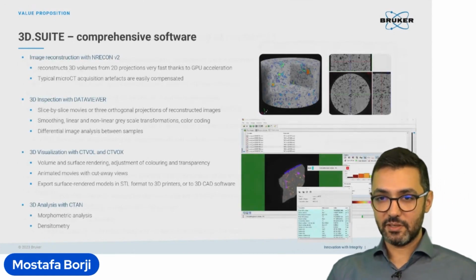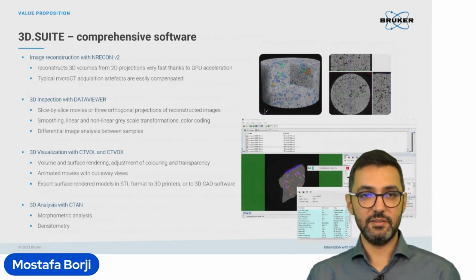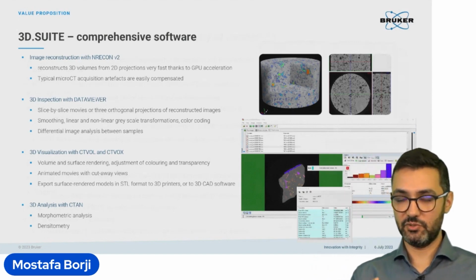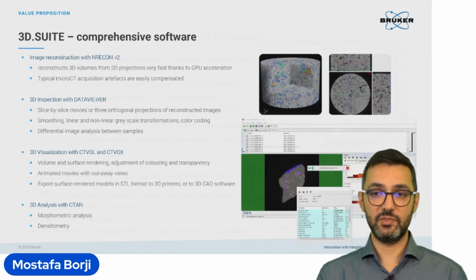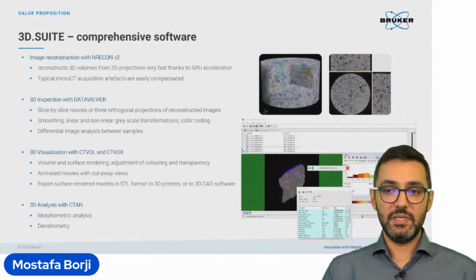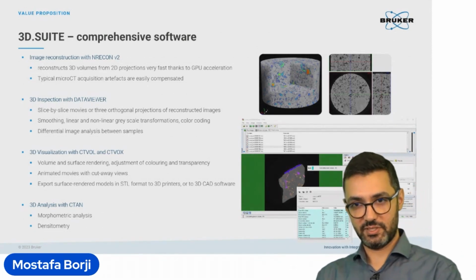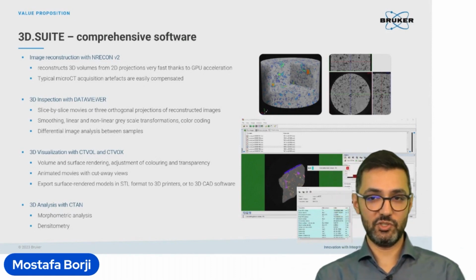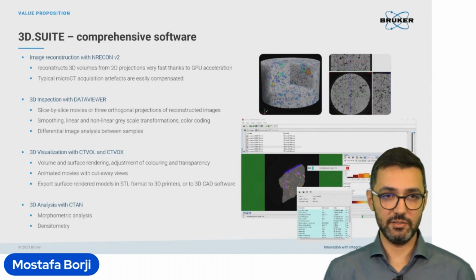So at the beginning, I mentioned that with all of our devices, a comprehensive 3D software suite will be provided as well. And this comprehensive software includes everything that one needs after the scan up to the very last stage, which is the sophisticated and advanced analysis.